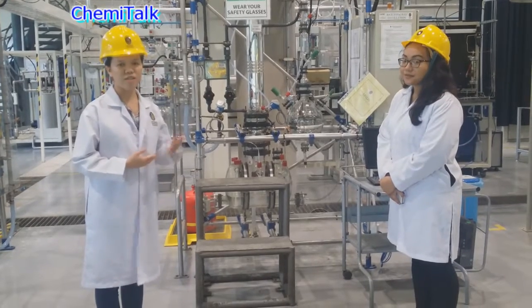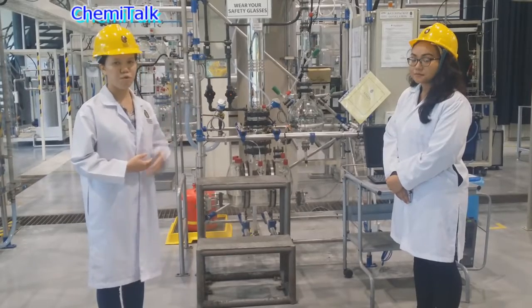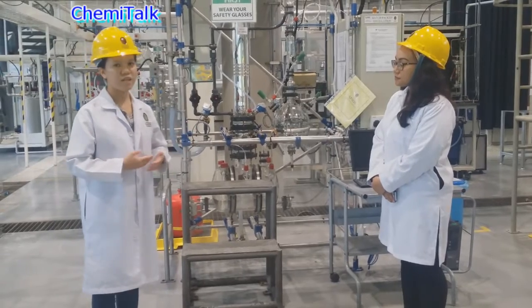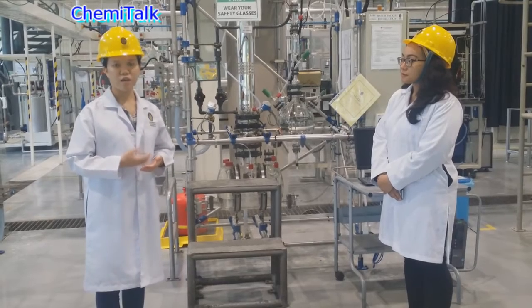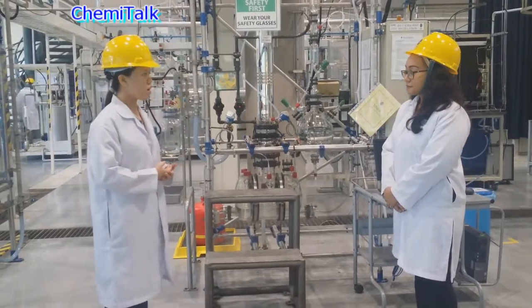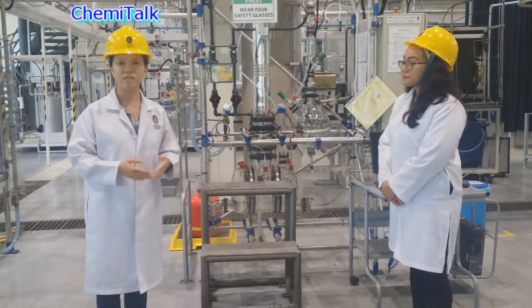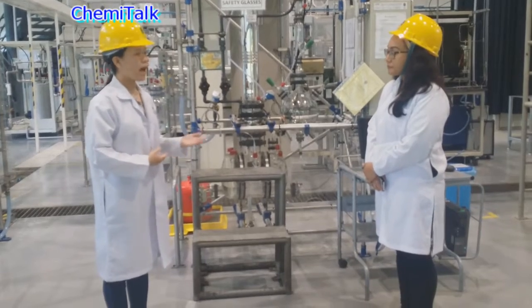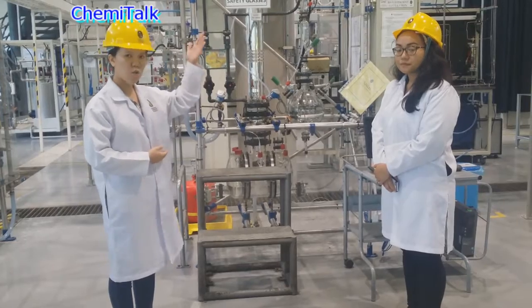Okay, varying the heater power of this experiment will affect the mole fraction of the distillate and bottom products. When the heater power is being increased, the temperature supplied to the reboiler is also increased, which in turn increases the speed of the evaporation process of the ethanol. As a result, the increase in the temperature will shorten the duration of the distillation as the ethanol will be evaporated faster. Besides, the higher heating power will cause a larger amount of ethanol being collected at the top of the column.